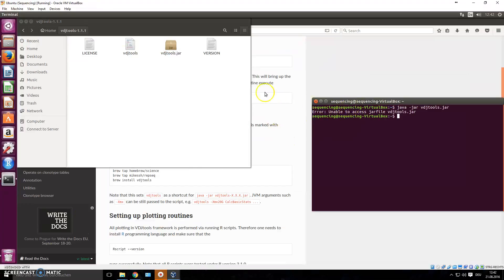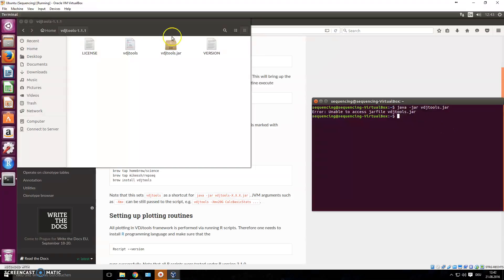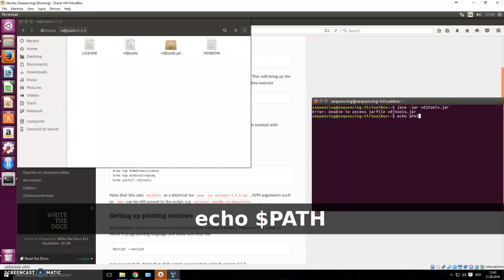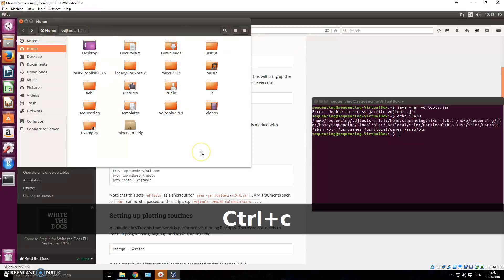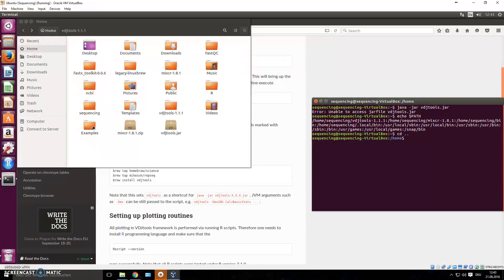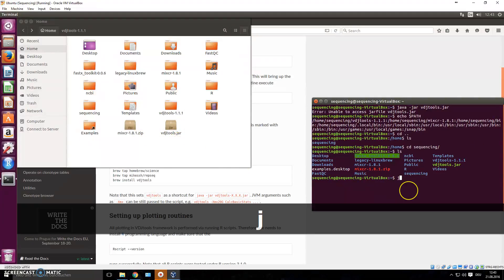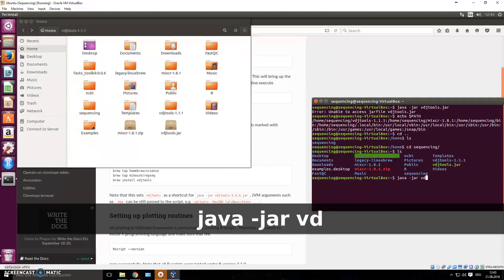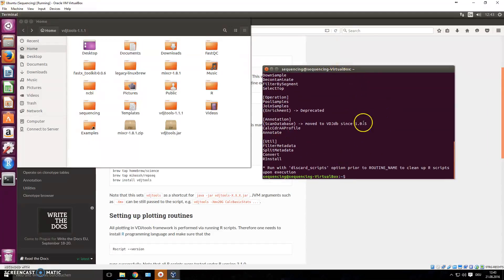I don't know why it's not working just by typing 'java -jar vdj_tools.jar' — we added the whole folder where the jar file is to the PATH, but somehow it's still not working. The way it works is if you just copy the jar file and paste it anywhere else and start it from there, it seems to work. So we'll go ahead and copy it to our home folder. From there, if we execute 'java -jar vdj_tools.jar', it runs the program.